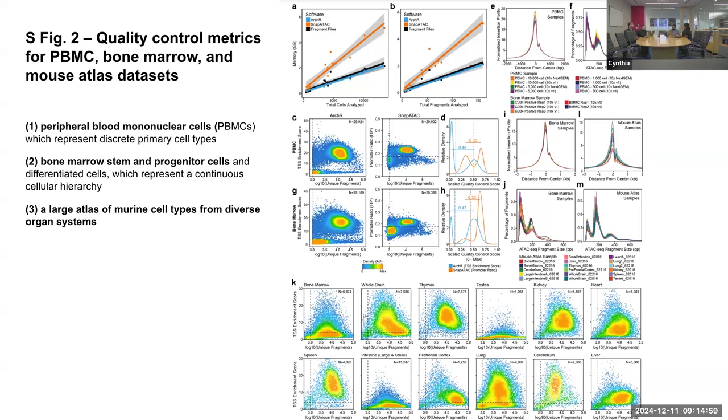They also use the well-established quality control metrics for epigenomic information that include the transcription start site enrichment score, an aggregate function to look at the quality score of the data. Traditionally we have a standard predefined by ENCODE. Usually we expect to see different kinds of TSS enrichment depending on the tissue and the kind of data we have, or whether the data is noisy or not.